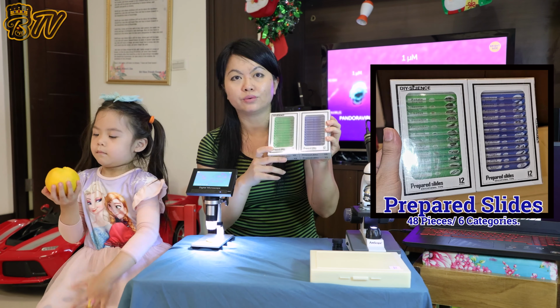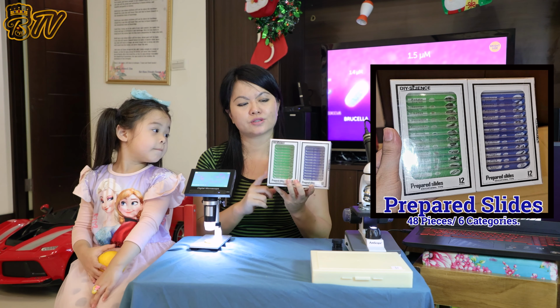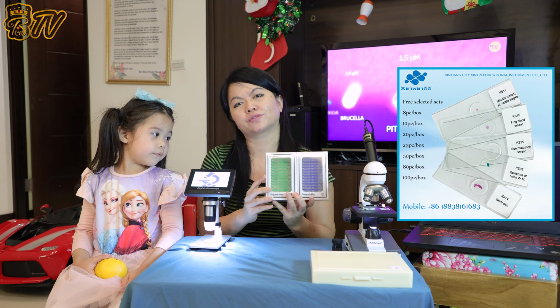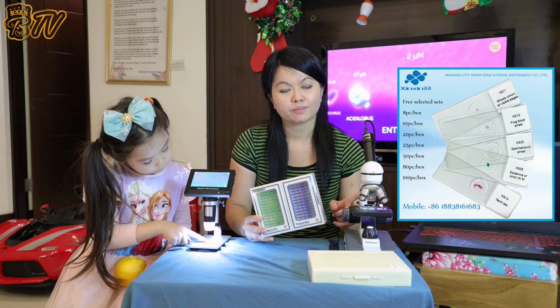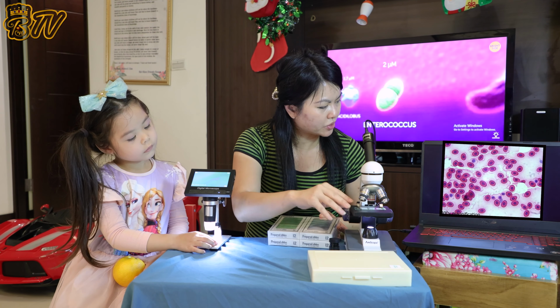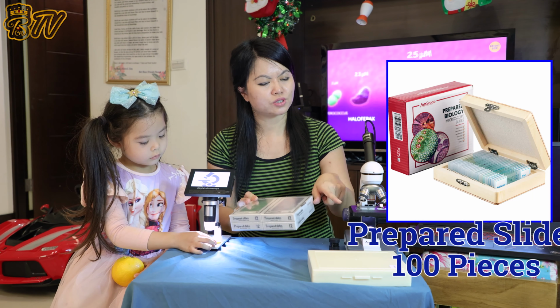There's another set that you can also purchase online called Prepared Slides, and they have like five to six different categories. There are plants, cells, insects, and also birds. Okay, you can take out the slide and then you add it into your optical microscope, and the slide goes right here. You hook it up and then you can get a really good visual of what the object looks like, okay? Like right here. These are feathers. Yeah, you can get a really good visual. So you just slide it right in.